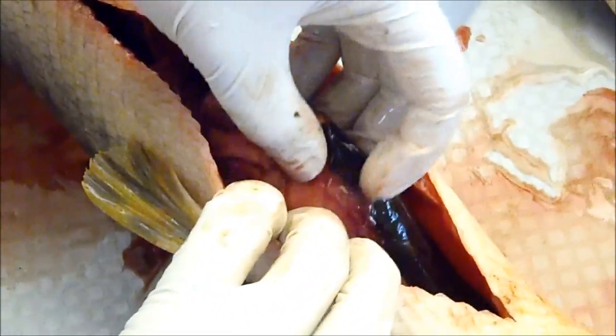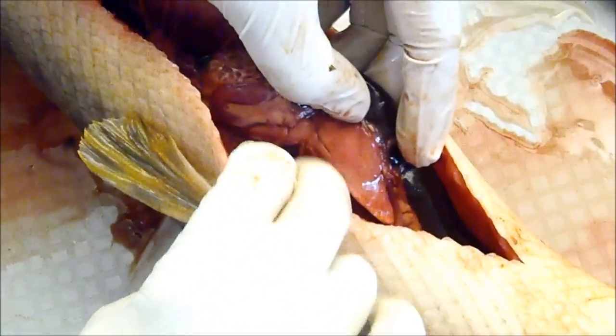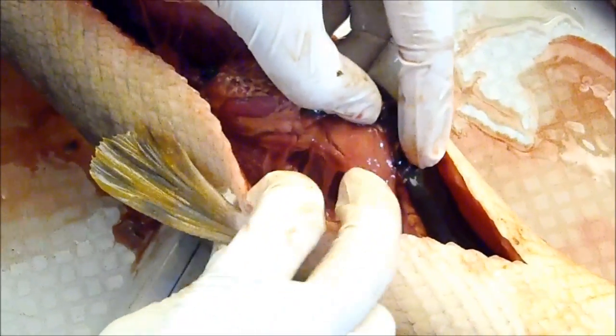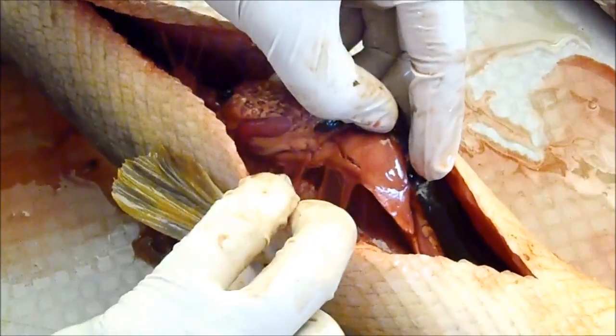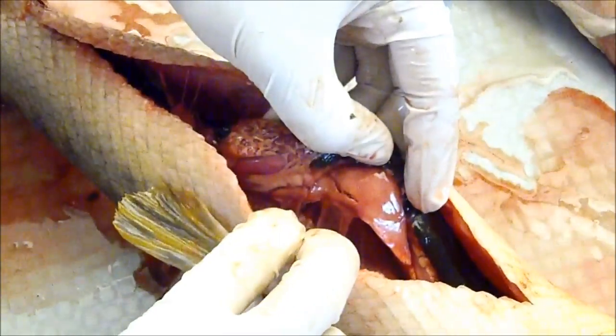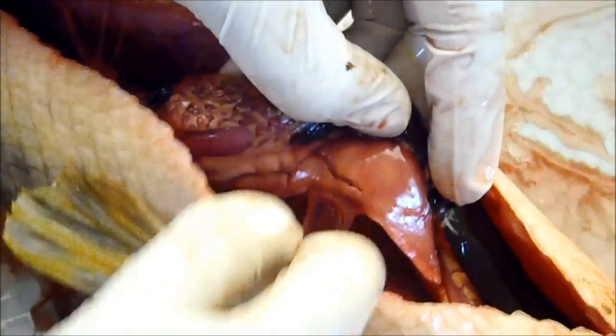Here you can see this connection looks like a series of thin threads — it's not necessarily a solid connection. You can see some thicker connections more anterior, and one thicker connection more posterior. It's a series of threads, and that's the vasa efferentia. In females, it would be one solid and relatively consistent-looking connection — a communal connection.